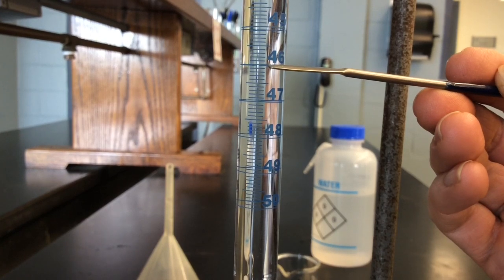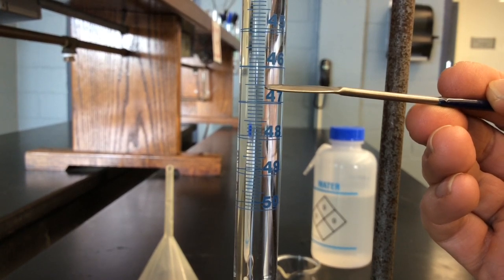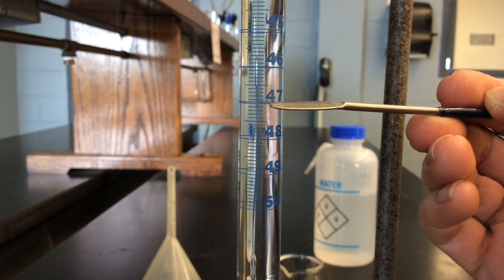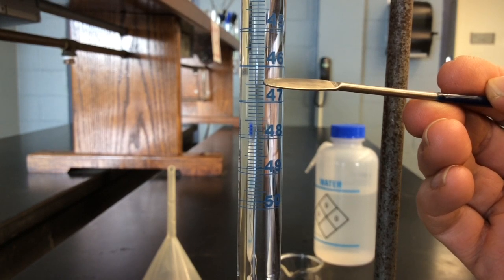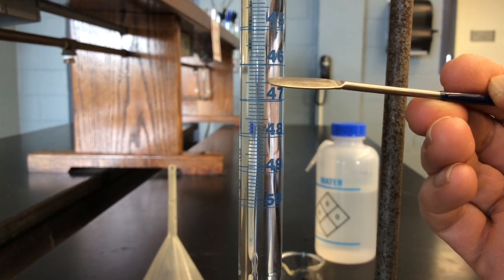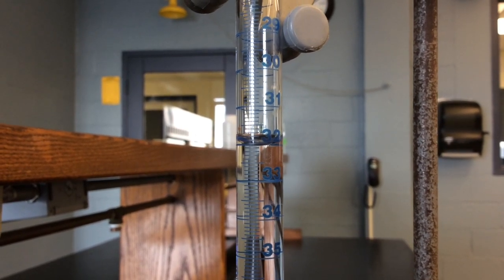There is a large line at 46 milliliters, and then 46.1, 46.2, 46.3, 46.4, a larger line at 46.5, and then we have 46.6, 46.7, 46.8, 46.9, down to the large line at 47 milliliters. And since we can clearly see the difference between 46.4 and 46.5 milliliters, for example, we can read to 1 more decimal place. To correctly record volume from your burette, again look at the bottom of the meniscus.